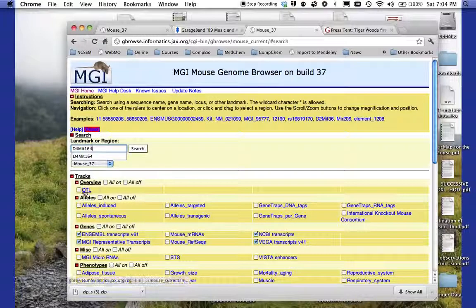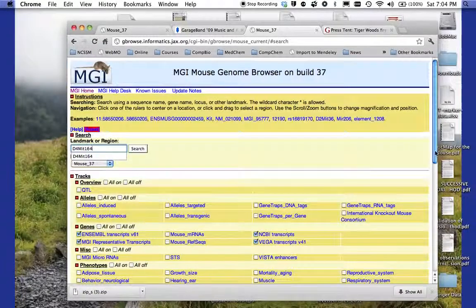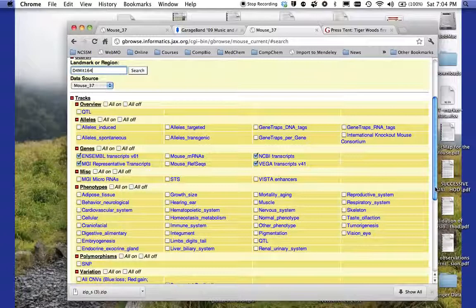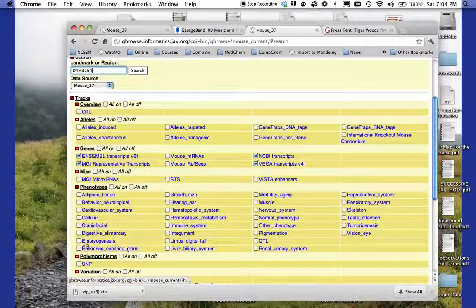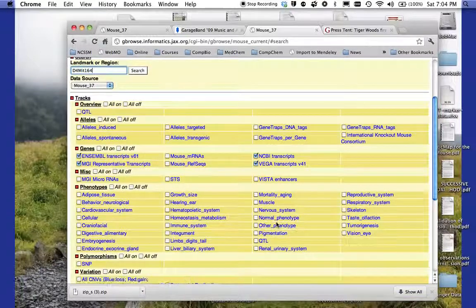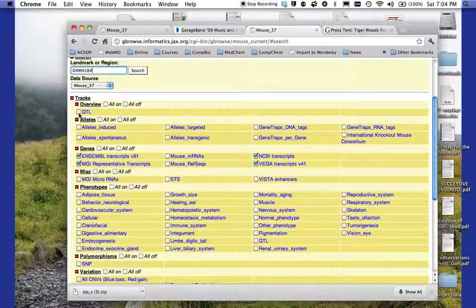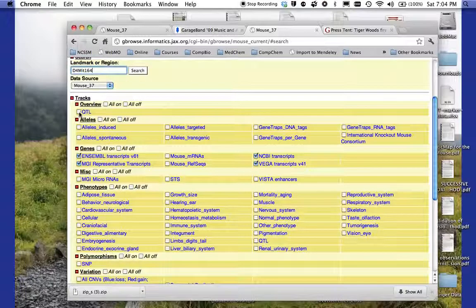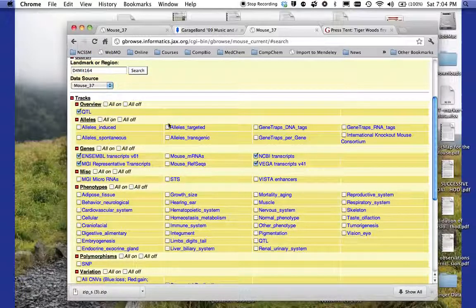But before I do that, I'm going to look down below here and see if there are any options that I want to look for. Notice here there are a bunch of phenotypes that I can have turned on. I want to look for a specific QTL. I'll go ahead and turn that on, but I don't think we'll find anything with that.